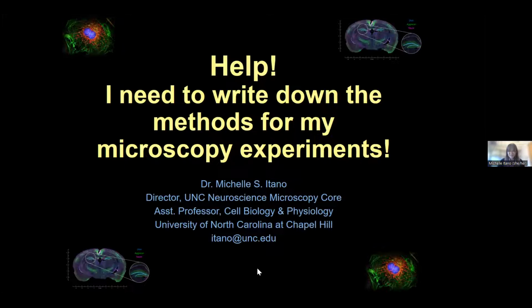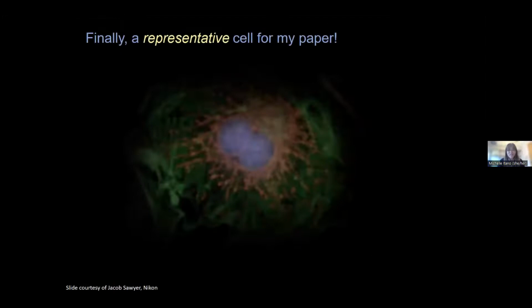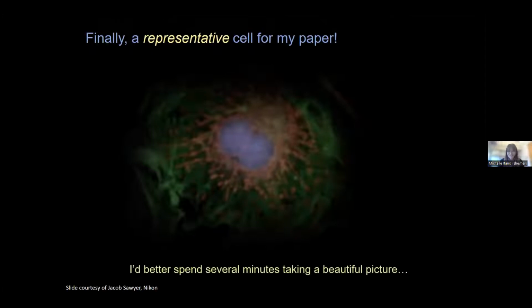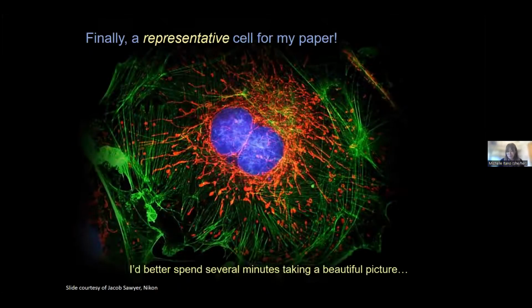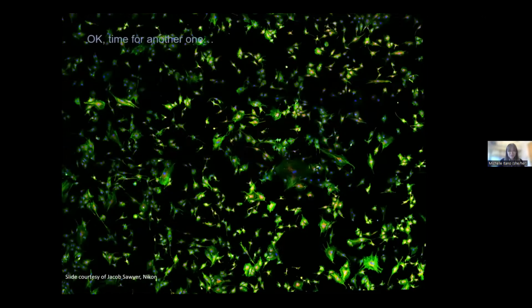So I'm just going to go through the workflow that I'm assuming many of you in the audience have had before, where you're sitting at a microscope and you say, finally, I found that cell, right? I better take several minutes to get my beautiful picture that will go on the cover of all of the best journals, right? And then you go, okay, well, I better take another one, right? And which one do I take at this point?